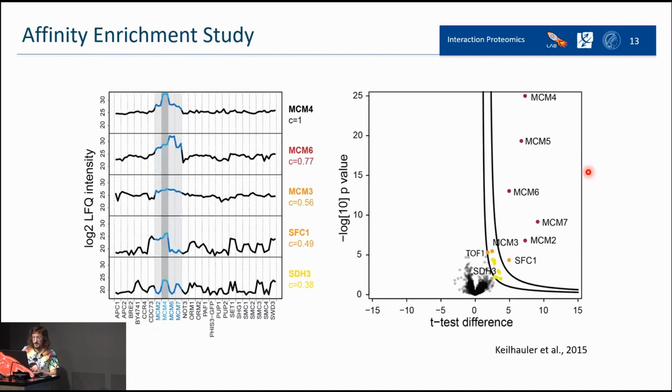Another way to further improve the data, to further be sure about what they got, they also used, with LFQ intensity, I forgot to mention that all these results were done with LFQ, the different profile plots.